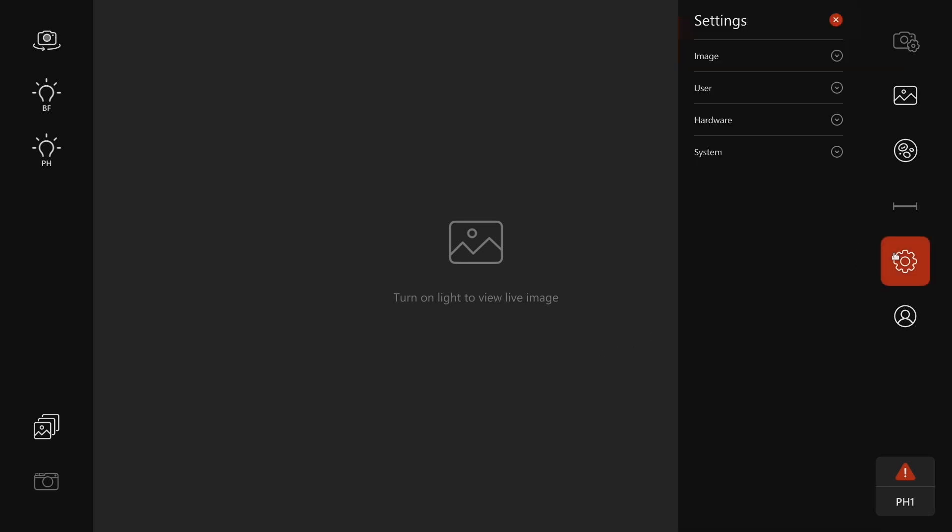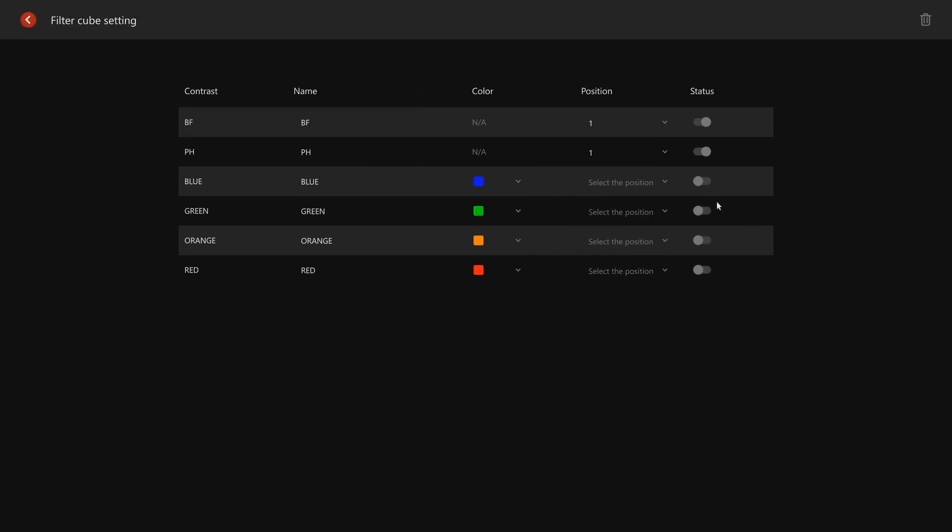To configure the filter cube in Mateo FL software, navigate to Settings on the main screen, then select Hardware and Filter Cube Setting. In Filter Cube Setting, select the position at which you installed the filter cube, then you can configure other parameters such as the name and the color of the channel.